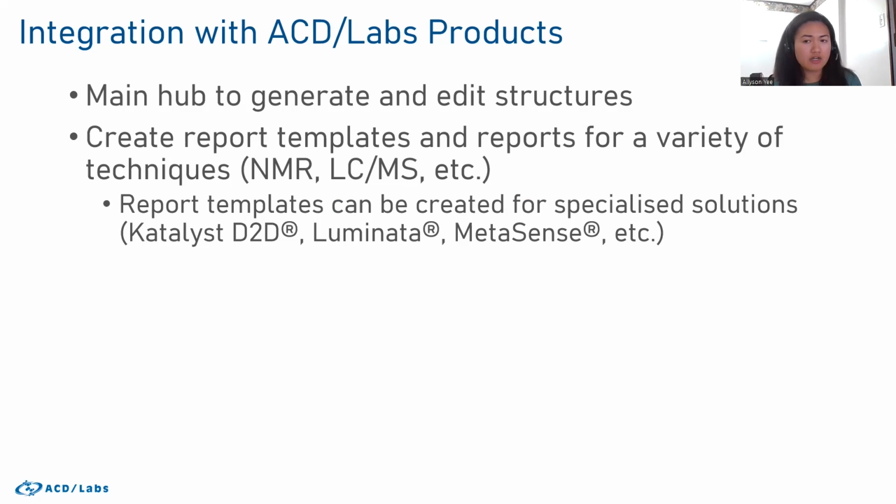And the final thing regarding compatibility is that if you have any other ACD/Labs products or software solutions, you'll know that ChemSketch is the main place you can create and edit your structures. ChemSketch is also the program where you can create report templates, for a number of different techniques, for example NMR, LCMS, UV, IR, any other techniques like that. You can also create report templates for our specialized solutions, such as Catalyst, MetaSense, Luminata.